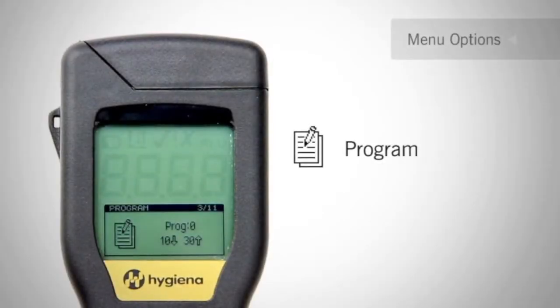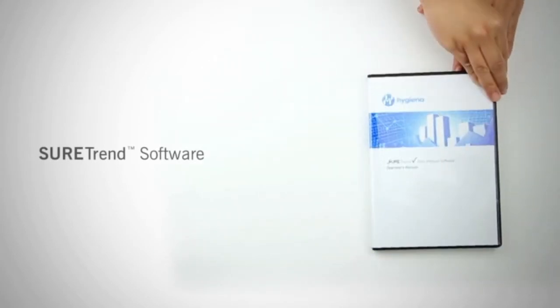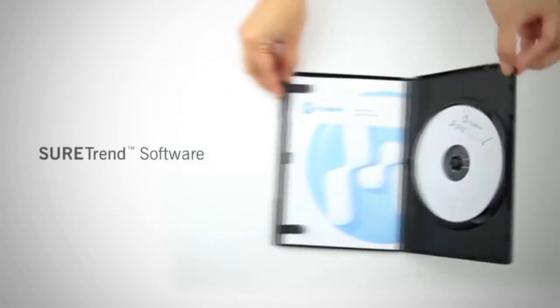Now that you've established your custom limits, we will discuss programming those limits. You can manually adjust the pass-fail limits on the instrument through the menu option Programs. Or, to get the most out of your monitoring system and be able to run charts and graphs with your test results, then program your locations using SureTrend software and sync to your meter.